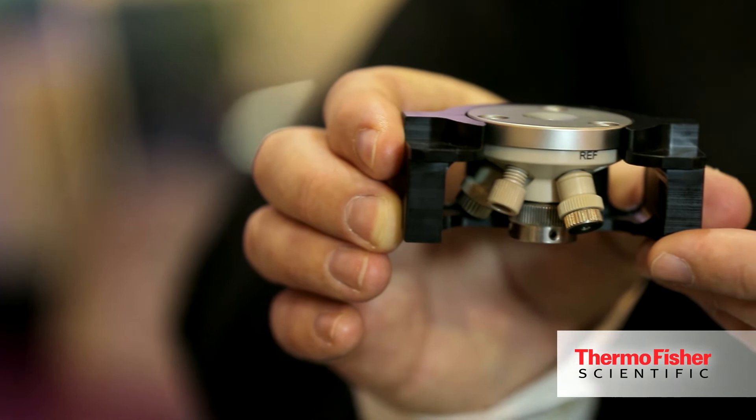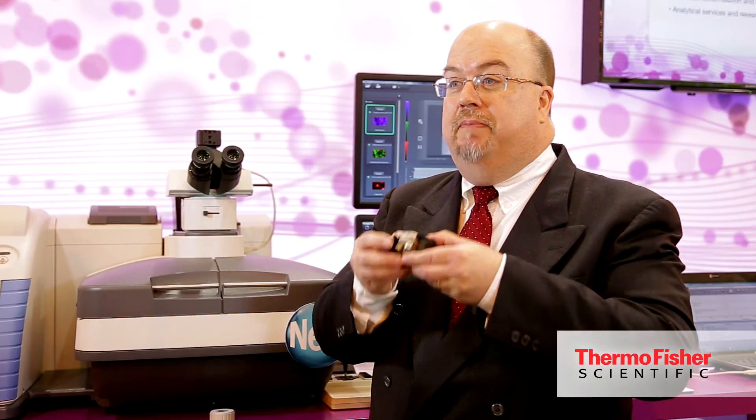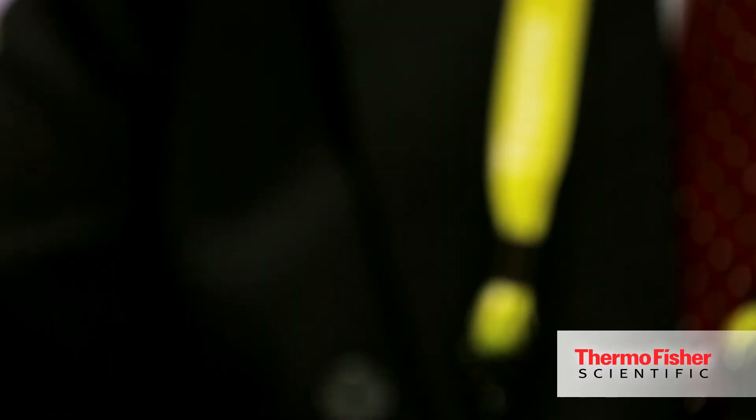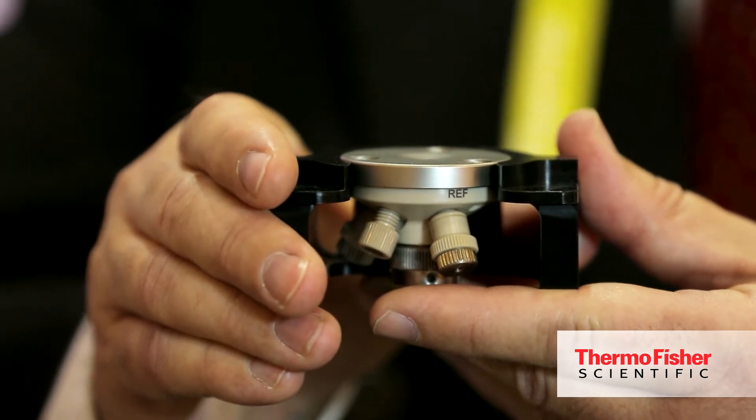They can look at changes in molecular structure that have happened during the charge and discharge cycle of the cell. The other part that we have is a device created by L-Cell, which is essentially an electrochemical cell. It allows users to build essentially a battery inside it, and it has a very small window. So once they've built up their cell, they can do the charge and discharge cycles and observe the molecular changes as they're happening in the cell.